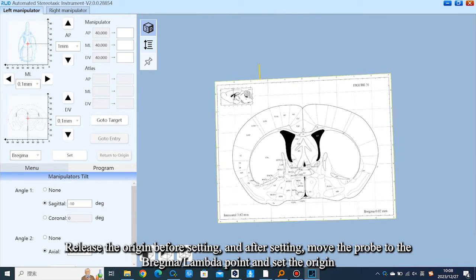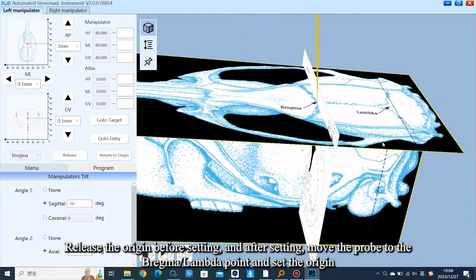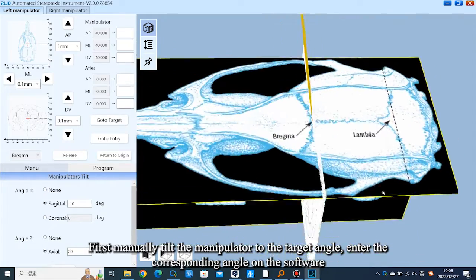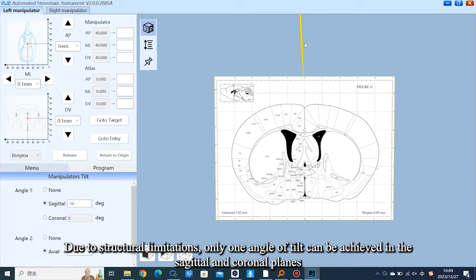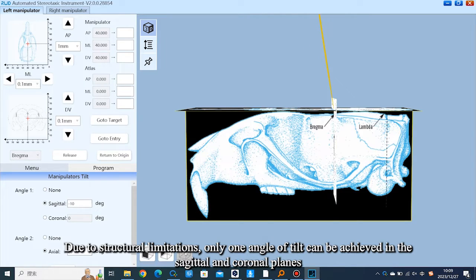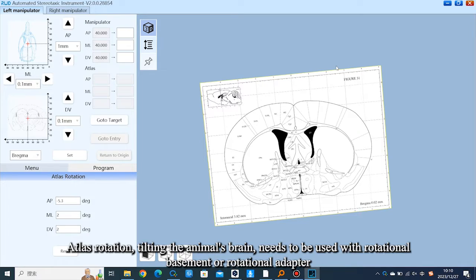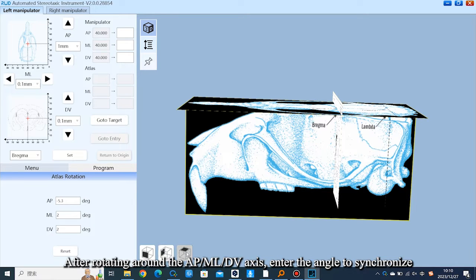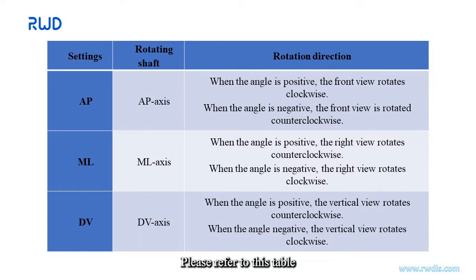Release the origin before setting the tilt angle. After setting, move the probe to the bregma or lambda point and set the origin. First manually tilt the manipulator to the target angle, then enter the corresponding angle in the software. Due to structural limitations, only one angle of tilt can be achieved in the sagittal and coronal planes. For ATLAS rotation — tilting the animal's brain — this needs to be used with a rotational base or rotational adapter. After rotating around the AP, ML, or DV axis, enter the angle to synchronize. Please refer to the corresponding table.